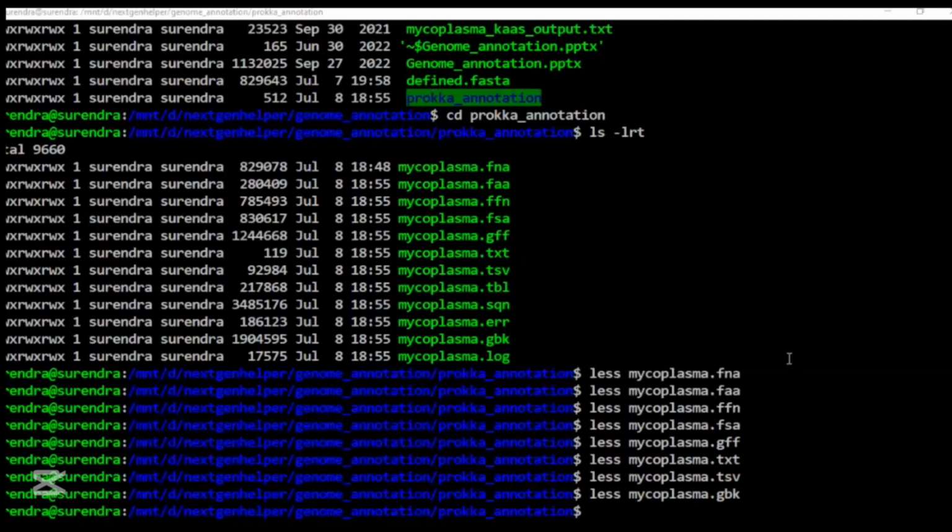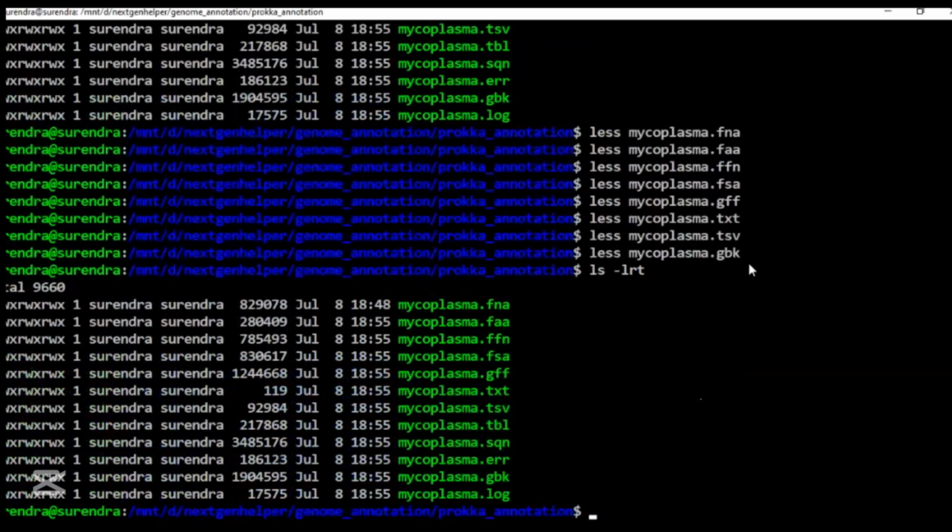Yes, actually, I have included this here for the prokaryotes. Okay, so once we have this output, we can go to other analysis. The other process which can be used here is Prodigal. Prodigal is also installed when you install Prokka. So if you install it using sudo or the conda environment, it will also install the Prodigal tool.